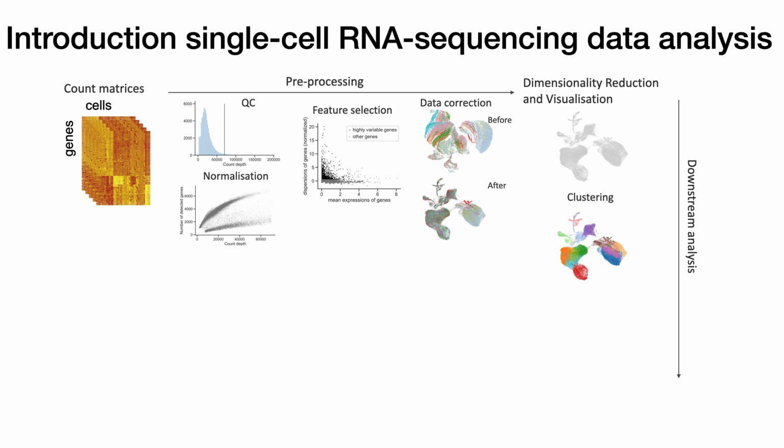So we group our cells by their similar properties, and then we can annotate these clusters, and this is usually done through a process using marker genes. So we use prior knowledge to see if a certain gene is expressed, and this is what we use to assign a certain name to a cluster.